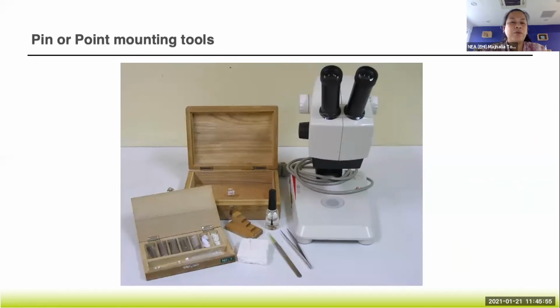You can explore. We've tried mounting medium for blood smears for malaria. For certain countries, the brand name is Entelan, but this one also takes some time to dry up.